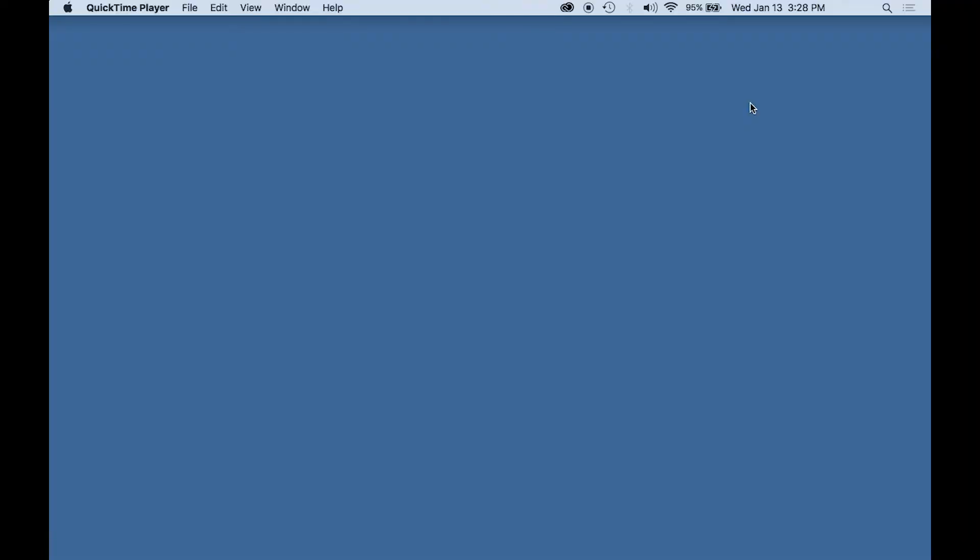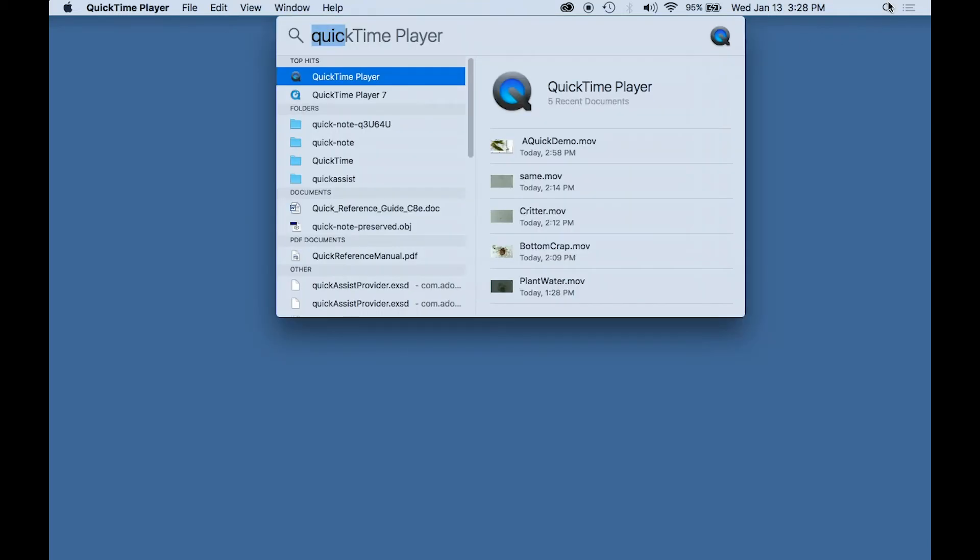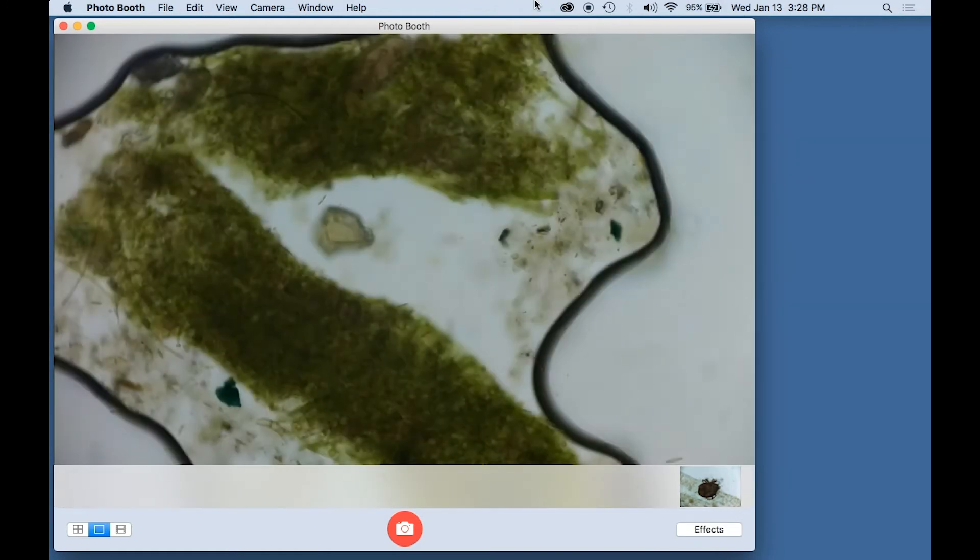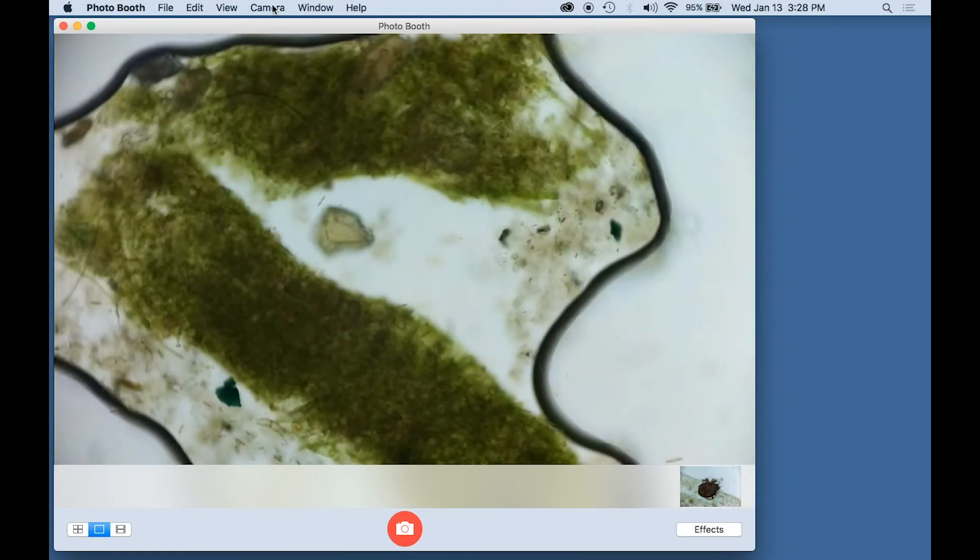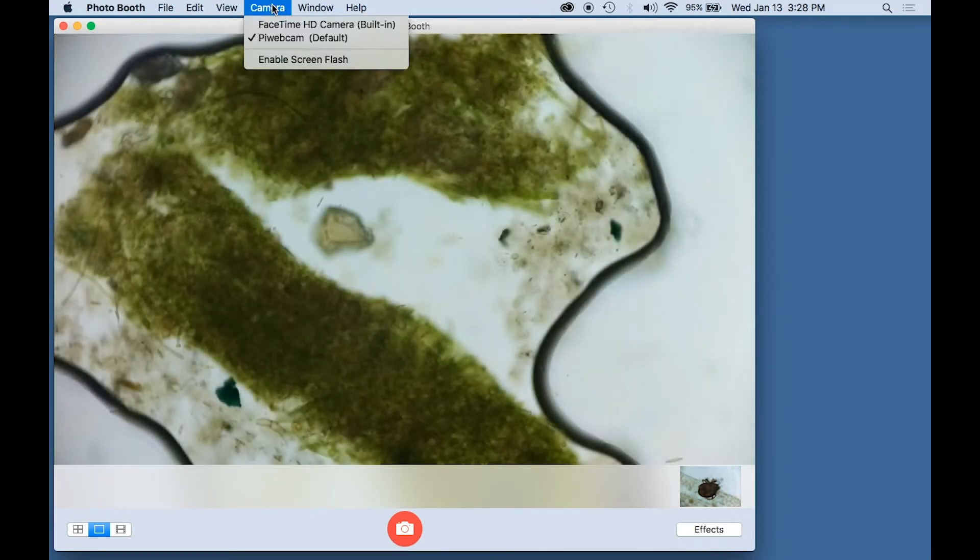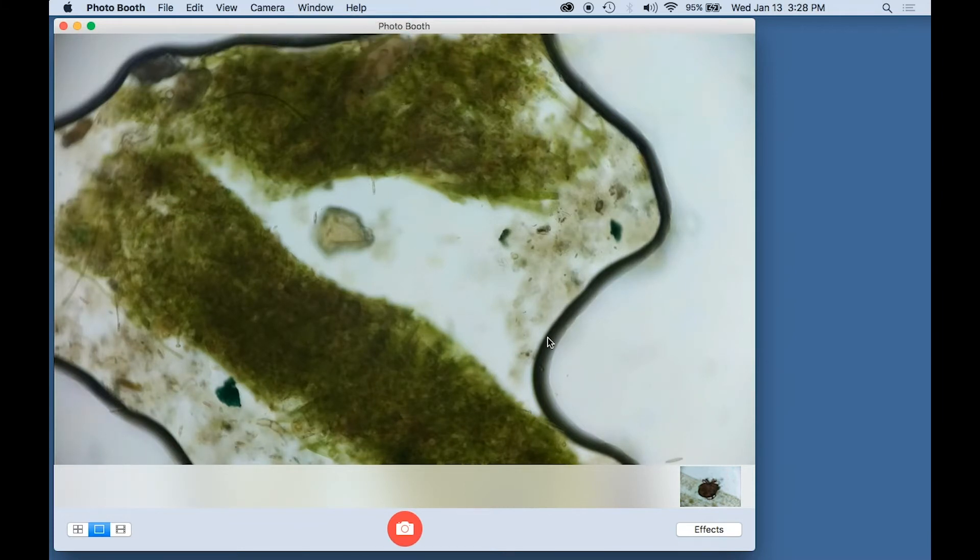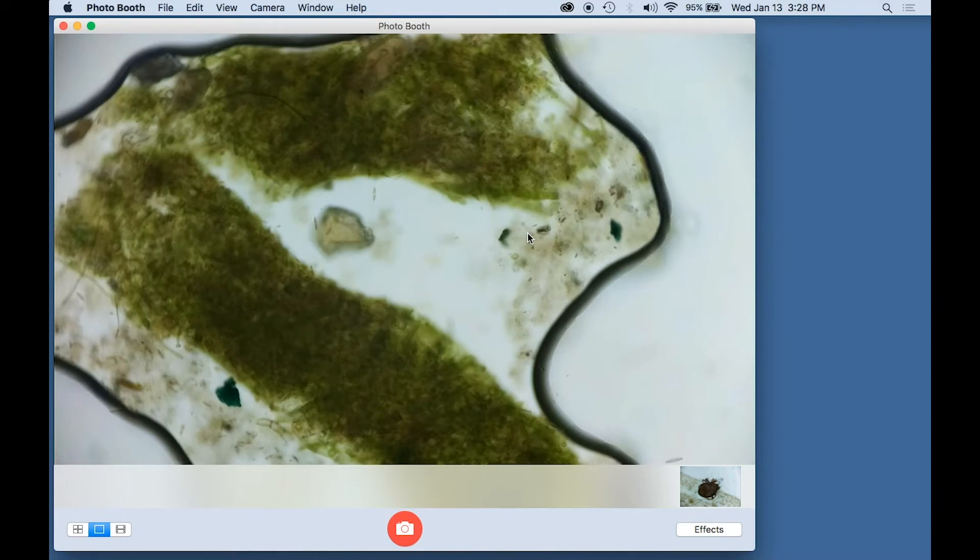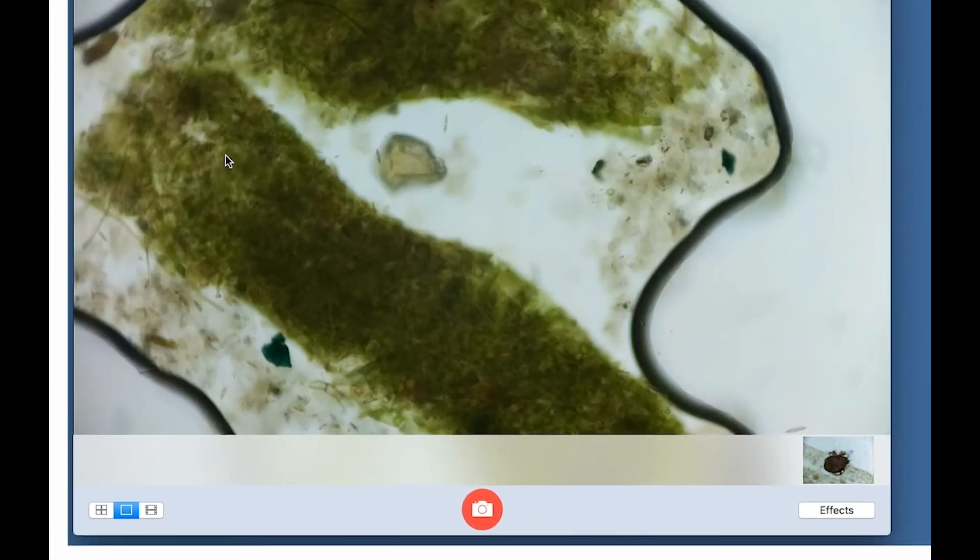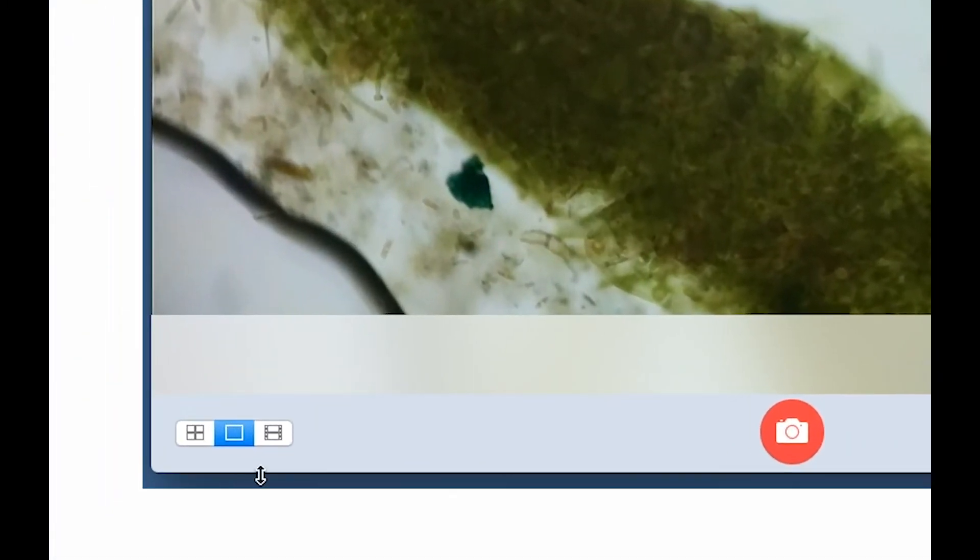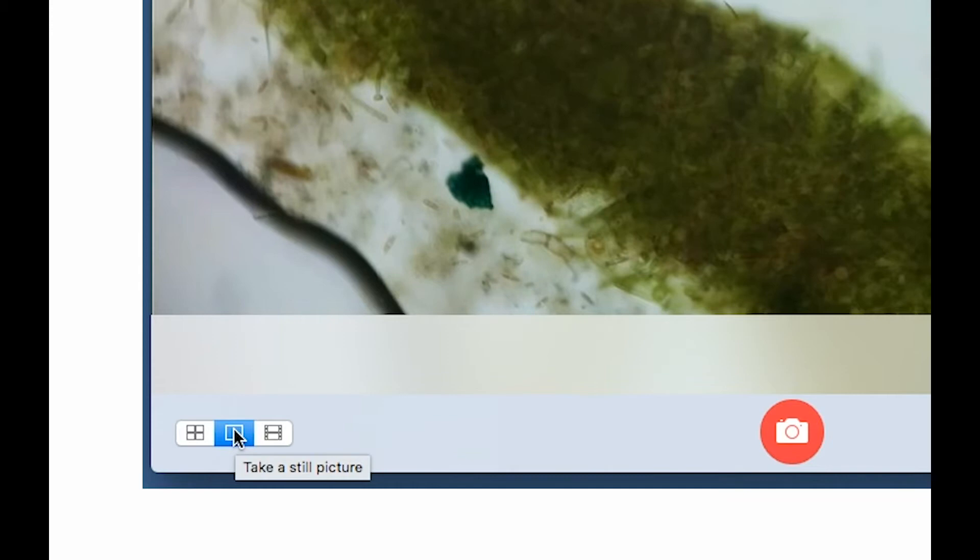We have the system booted, and we have the camera plugged into the computer, and we will now demonstrate the system using Photo Booth. First, we will run Photo Booth. The image that comes up is actually the image from the camera because it has remembered the Pi webcam as the camera selection. Now with Photo Booth, you can take both still pictures and video pictures with this control right here.